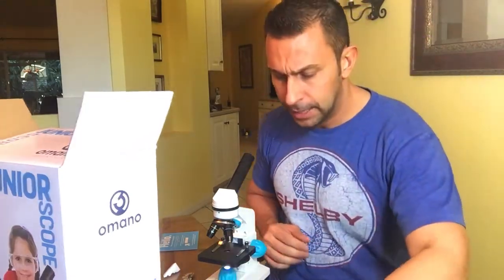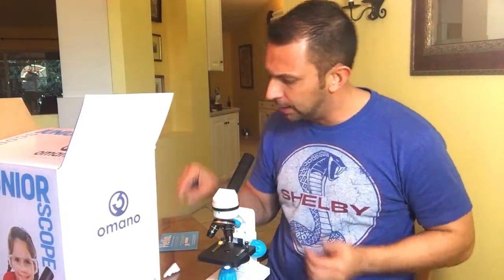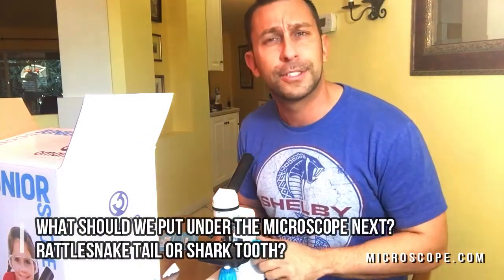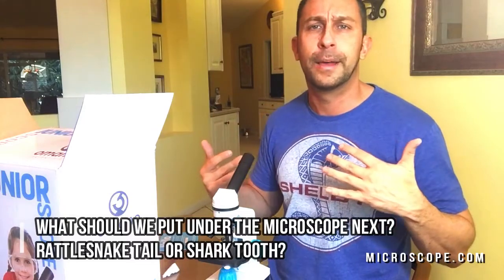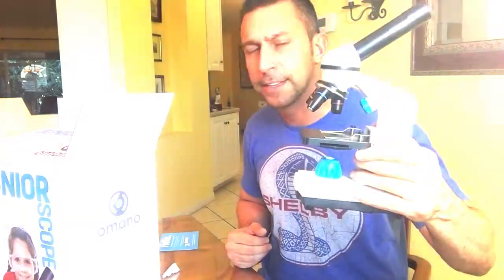This is a fun little kit. In the meantime, I have a little frog I found in my garage — I guess he died of natural causes in the garage, but now he's just a frog skeleton. So I'm going to put him under my USB microscope and we're going to take a look at him together, then I'll come back and tell you a little more about this.